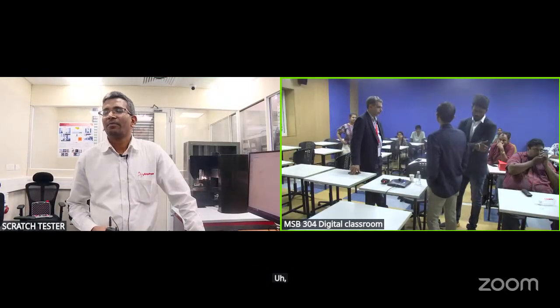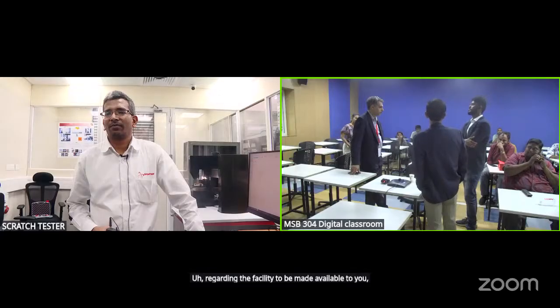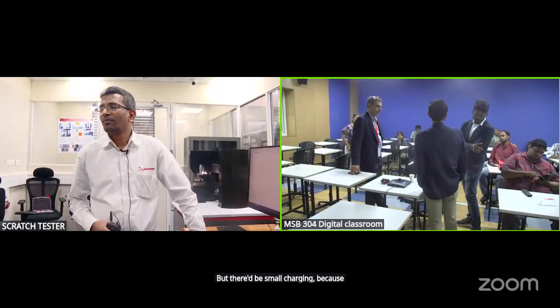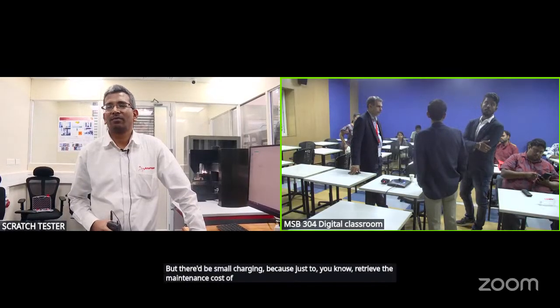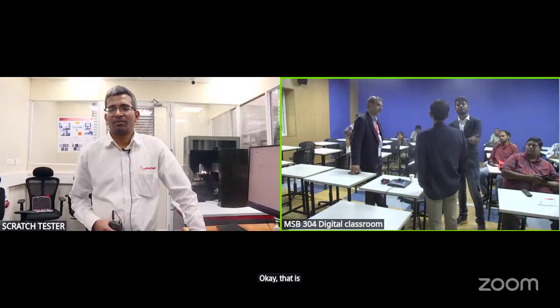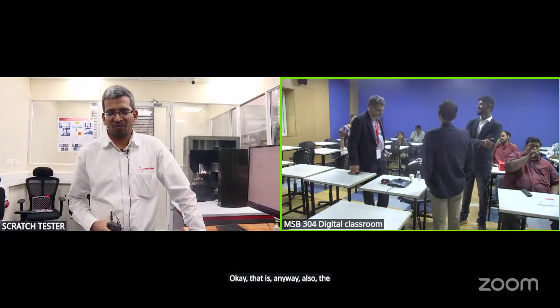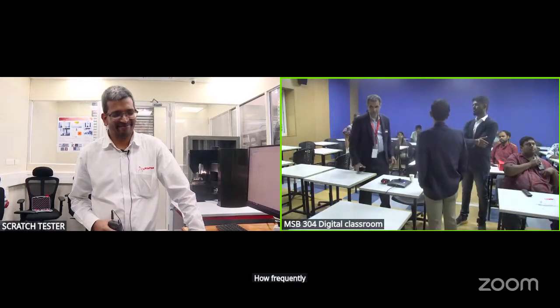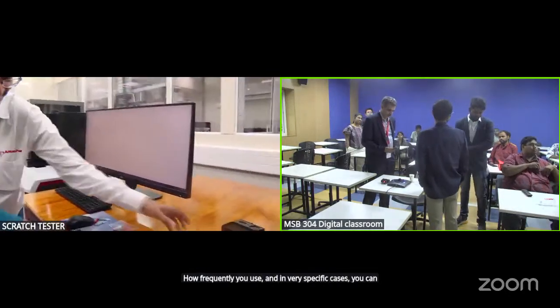Regarding the facility to be made available to you, it might be from January onwards. There would be a central portal. You can book it, but there will be a small charge, just to recover the maintenance cost of this machine. It's very nominal. Also, the indenter's cost is important. That depends on how frequently you use it, and in very specific cases you can have your own indenter also.